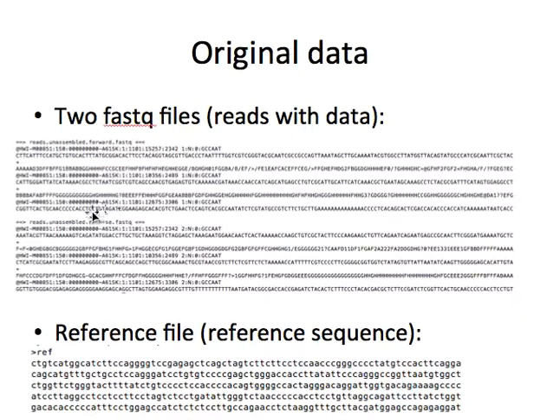So some more details of the original data. As I said, the biggest amount of data comes from what we call the FASTQ files that contain all the sequences that we sequence from the populations of cells. And these files are very simple. As you can see, they are very long text files. In the case that I am using there will be 30,000 reads, normally we have millions of reads. And basically they always consist of an identifier for the sequence, a line that encodes the sequence, a plus symbol, and then some quality values that inform of how well each base was sequenced.